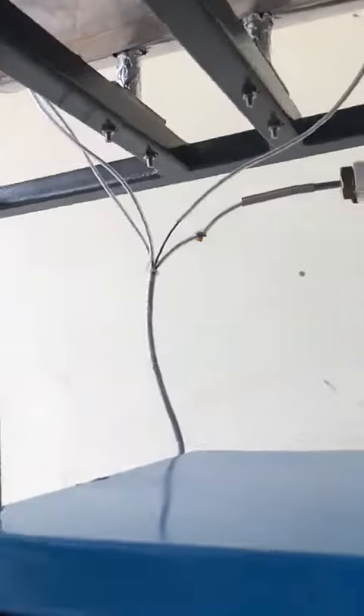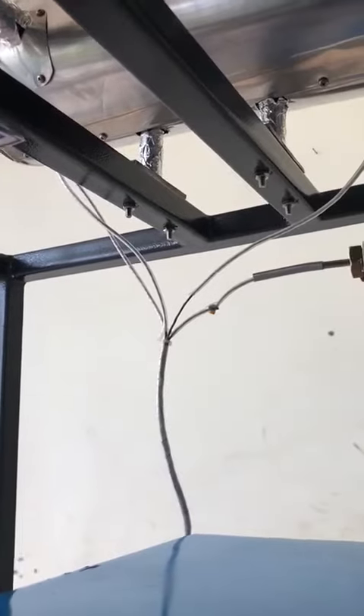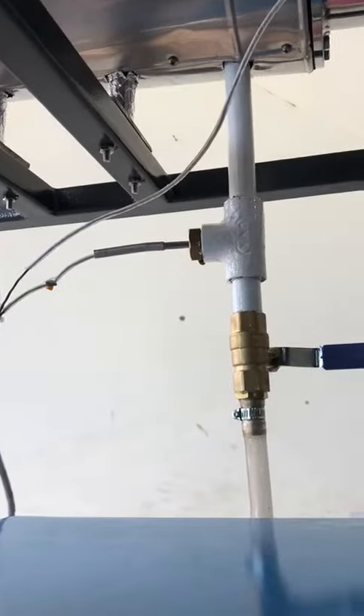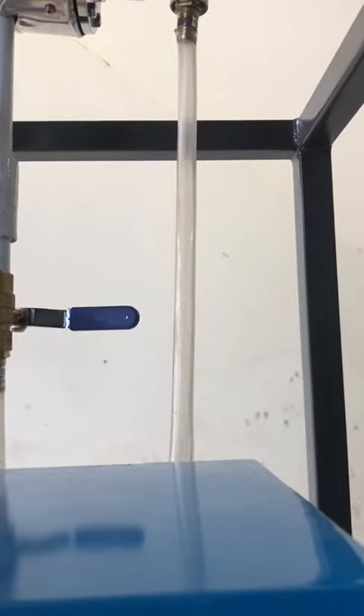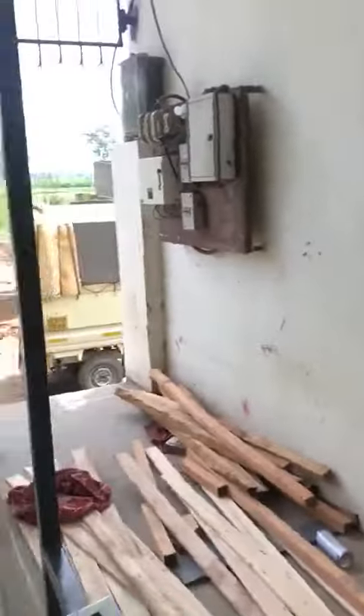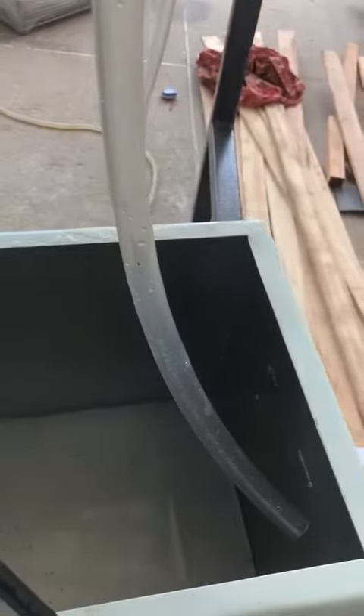Somewhere there is a condenser and the stream will go through this pipe — it is totally insulated. After that the stream will go to the condenser and condense over here. Then we will take a sample from here; at this point there is a sampling tank.